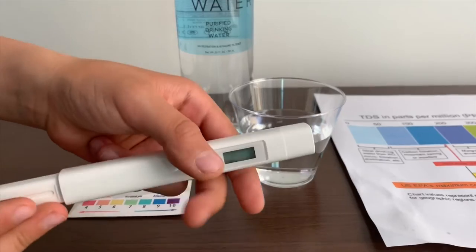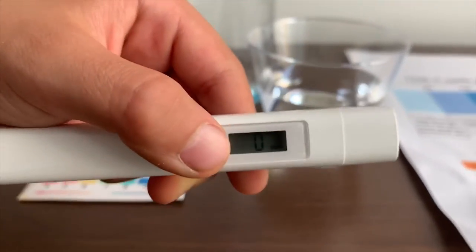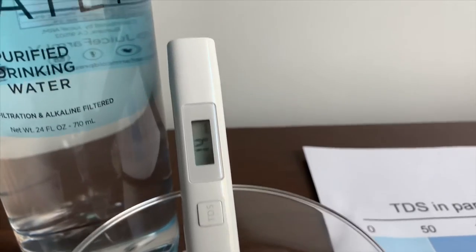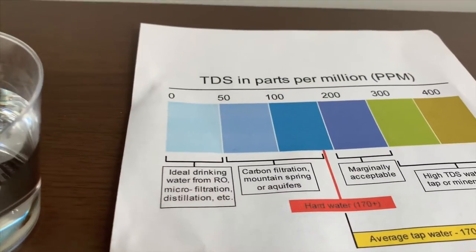If you want to buy this TDS tester, check the link down below. Turn on the TDS tester, make sure it says zero and put it in. 14. That is ideal drinking water. It just turned to 15.